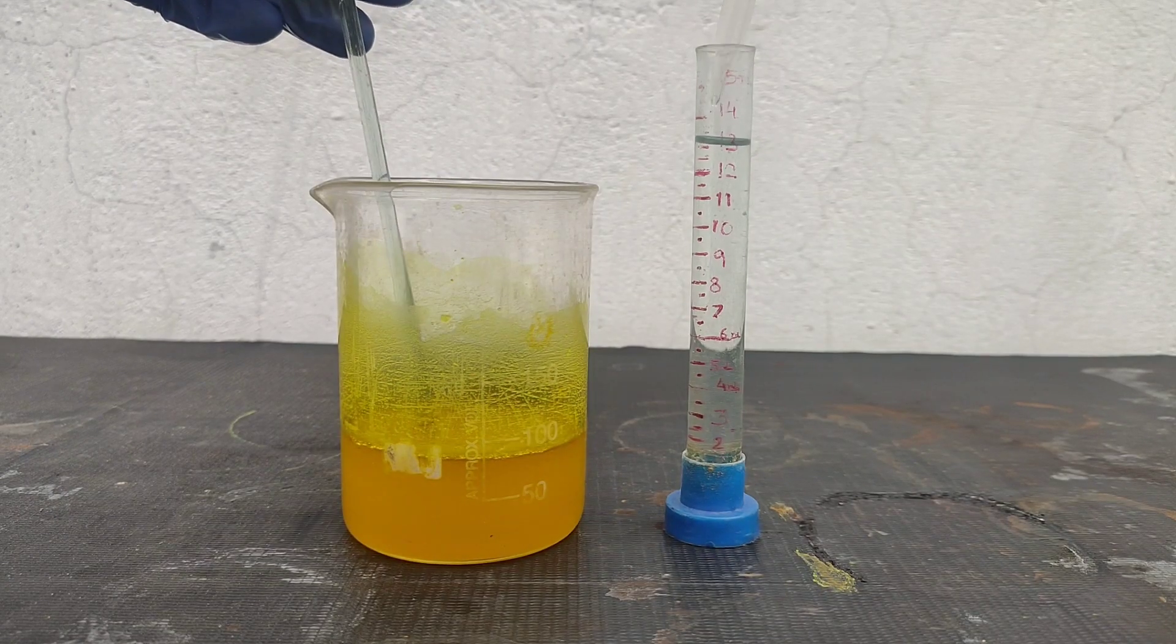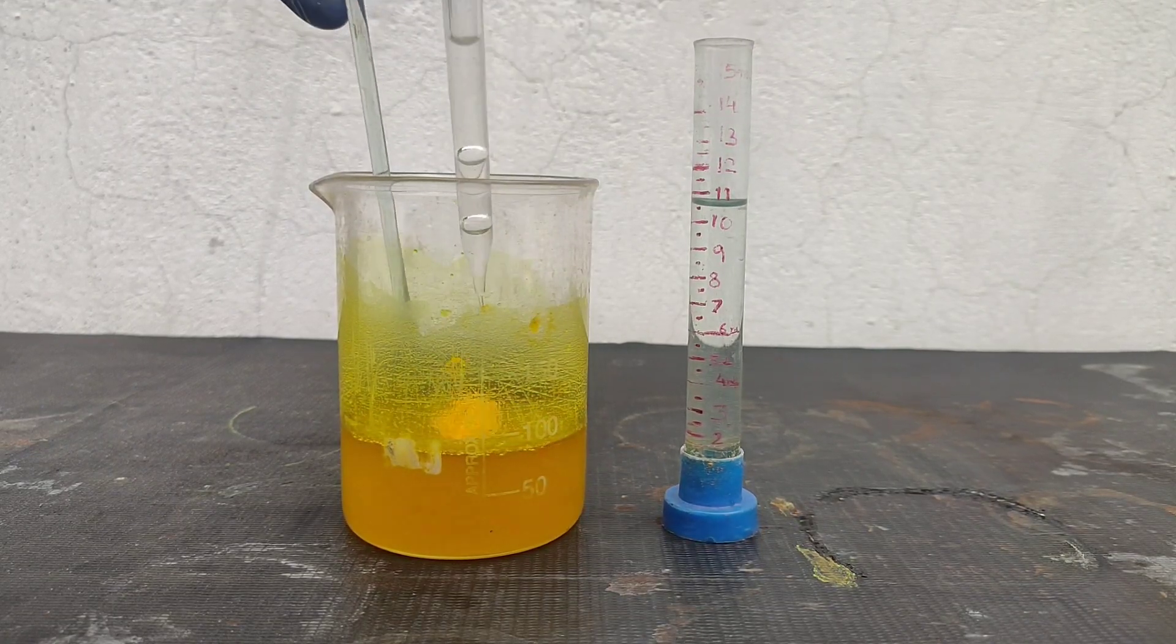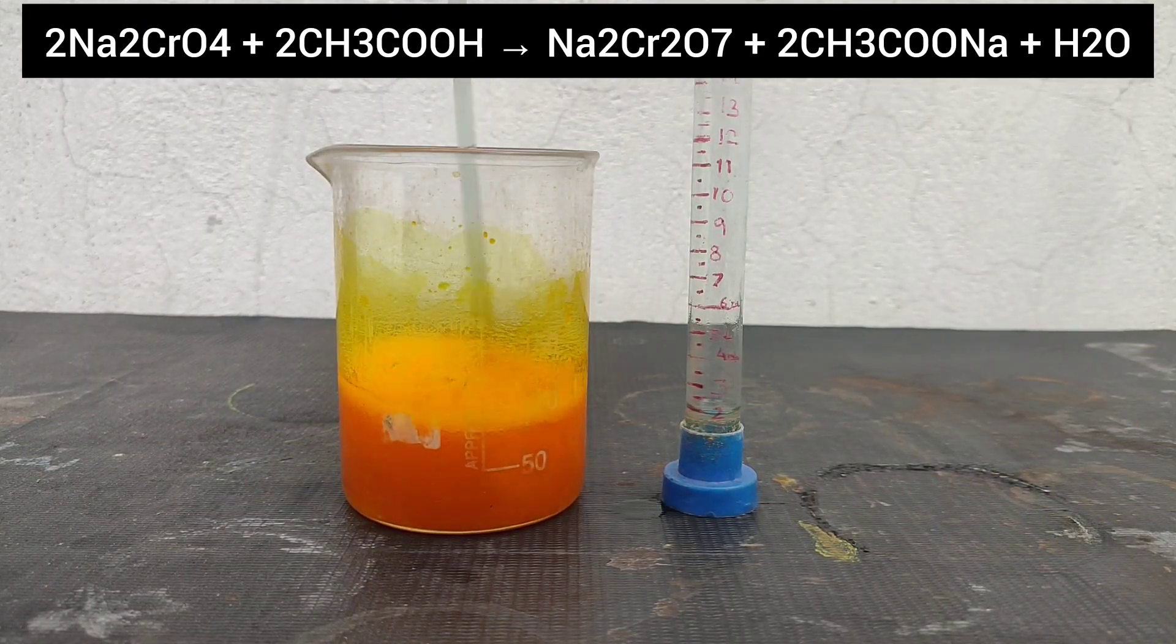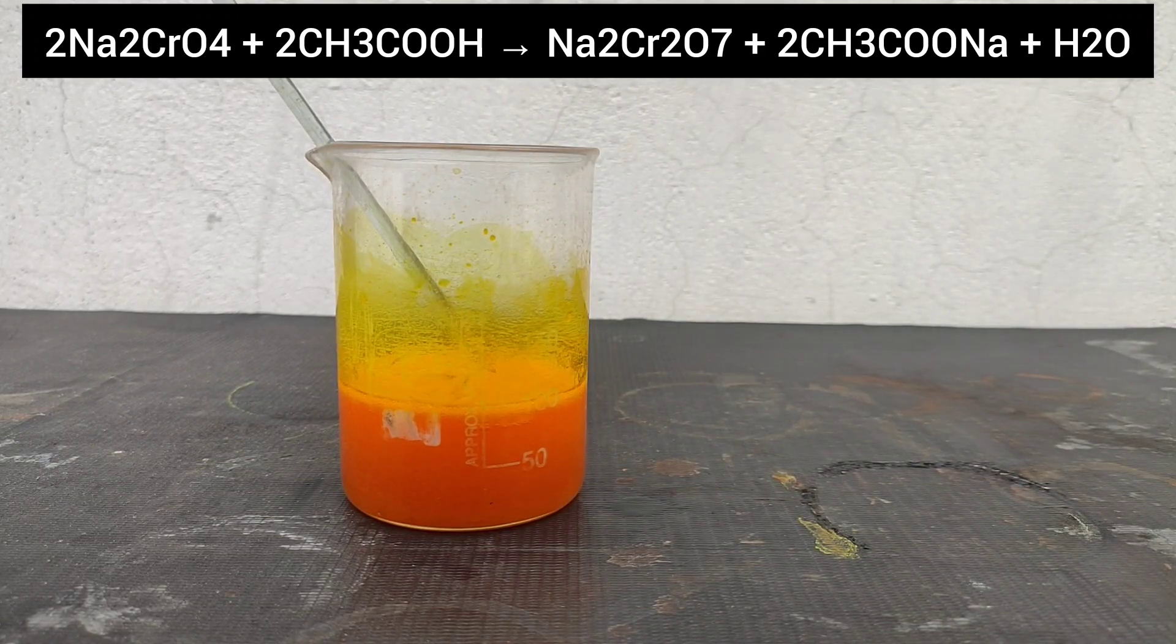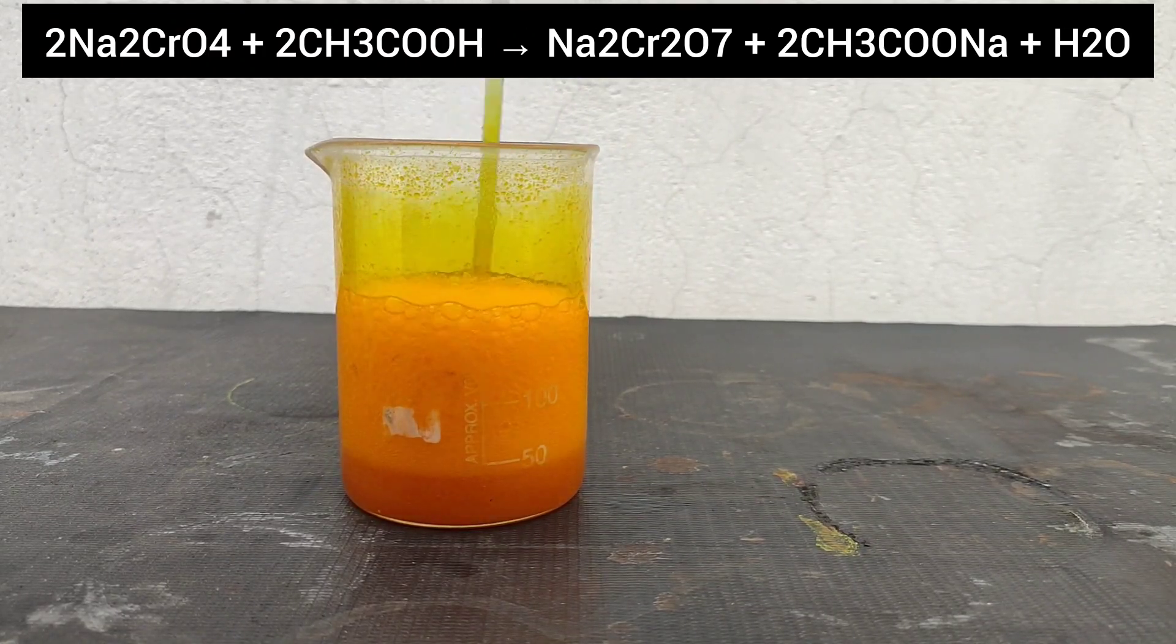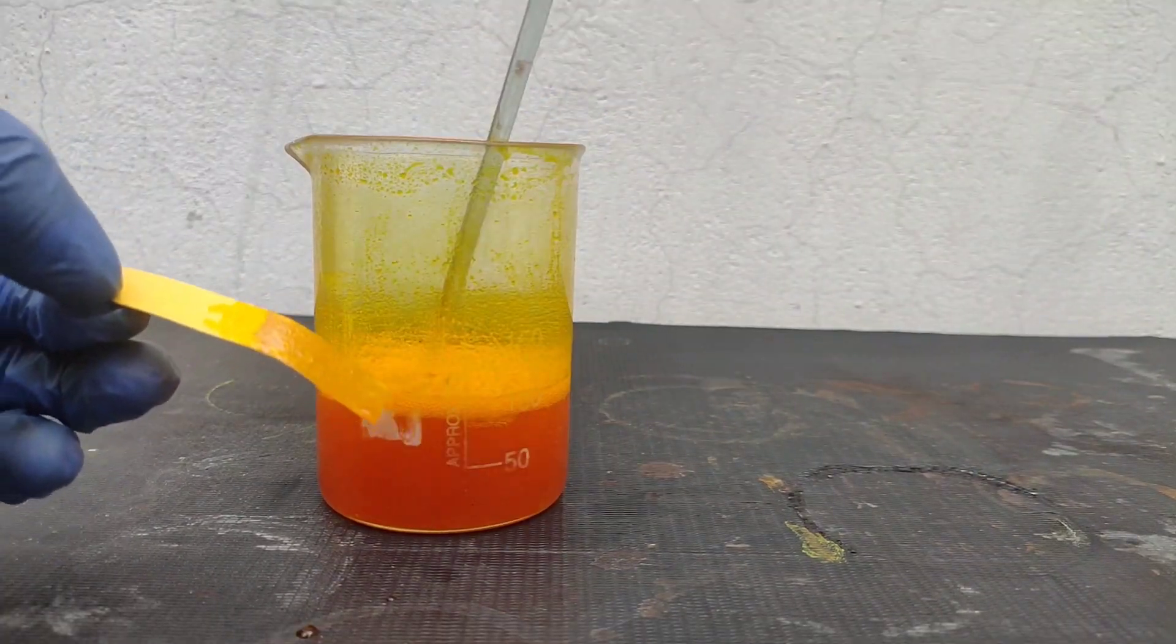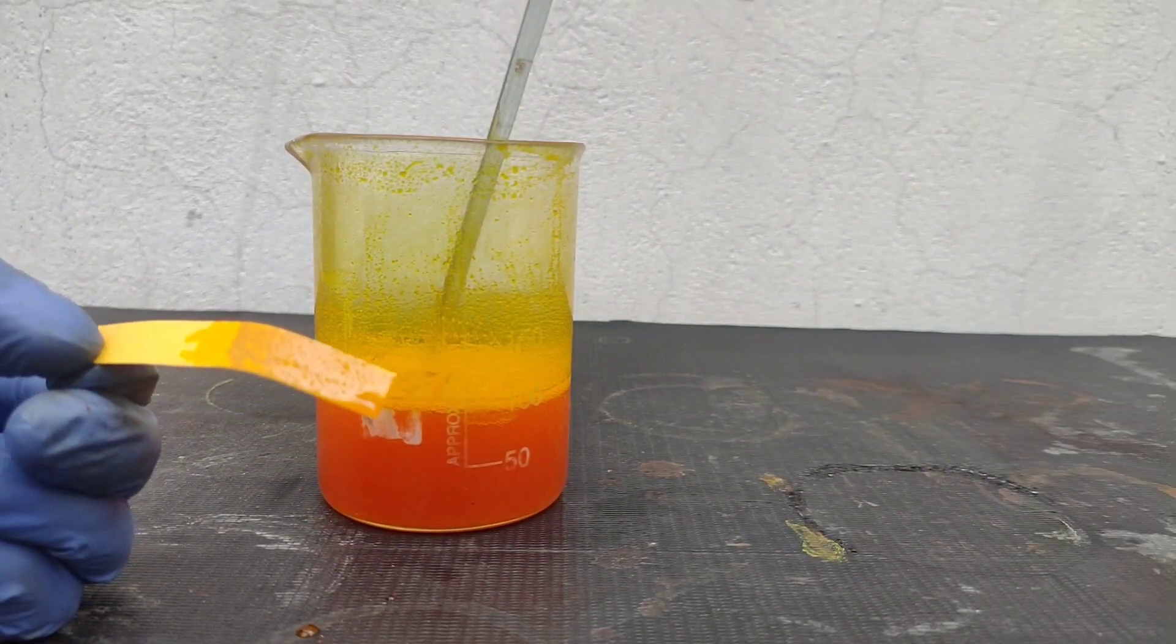I added the acetic acid slowly. First it reacted with unreacted sodium carbonate to give carbon dioxide, and then on further acidification the solution turned orange. I added 1 ml acetic acid in excess and checked the pH. It was around 5 to 6, which is due to the buffer formed by acetic acid and sodium acetate produced in situ. Even on adding excess acid, pH didn't go lower.